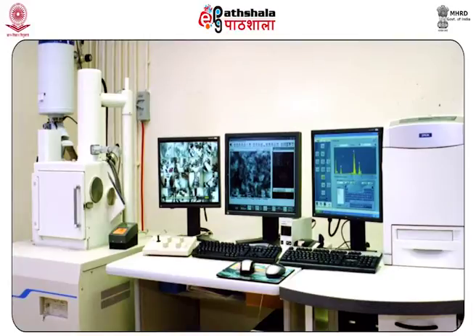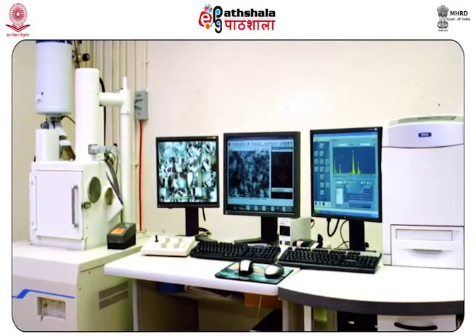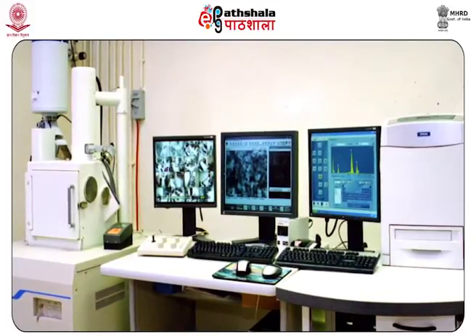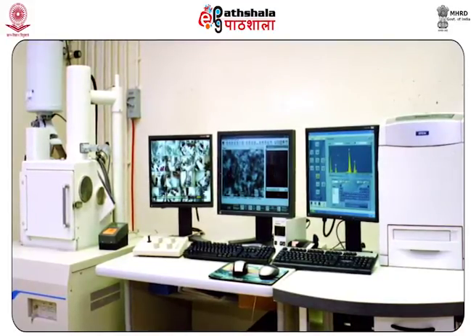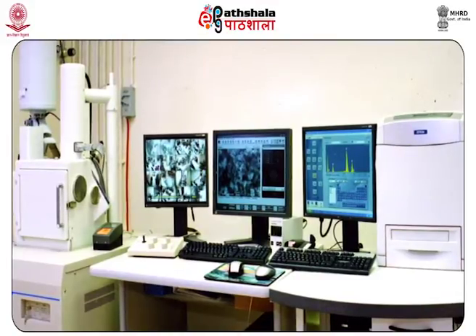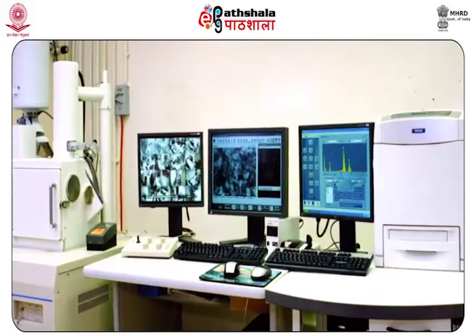Along with it, we have come to know that one of the biggest advantages to the forensic scientist is that gunshot residue particle analysis is non-destructive in nature, and the sample can be preserved for court evidence as well.